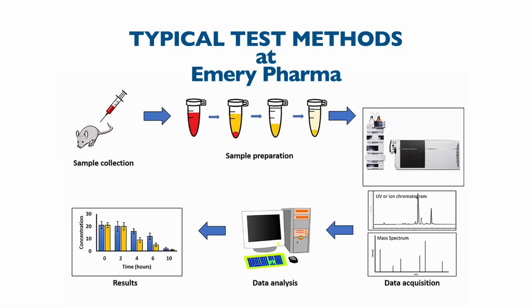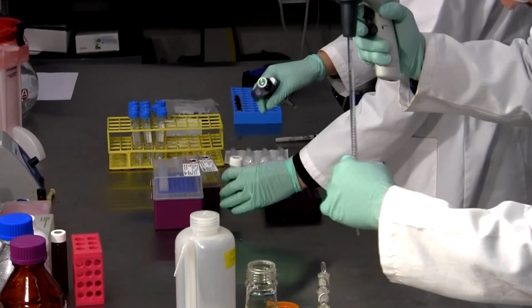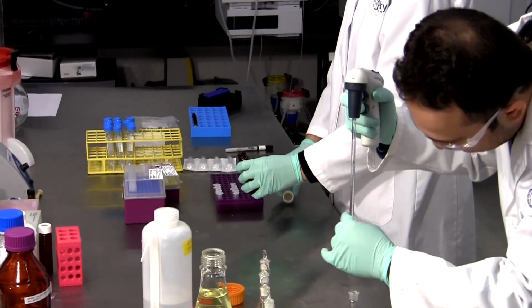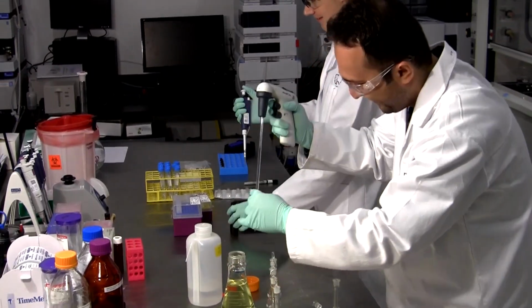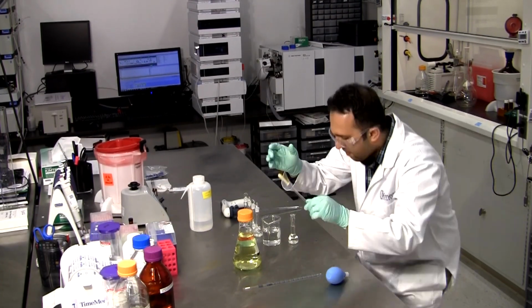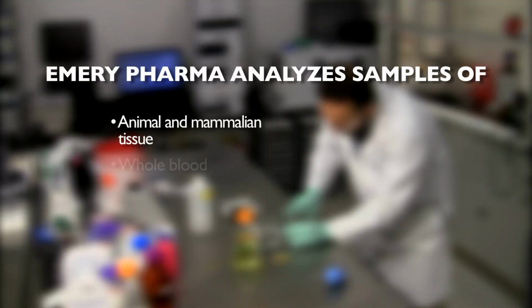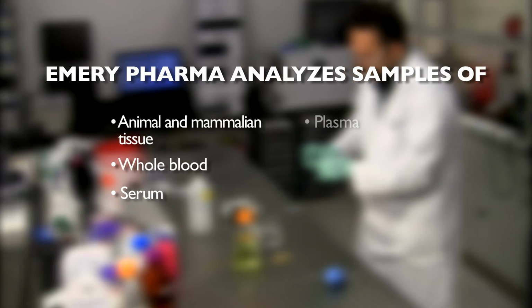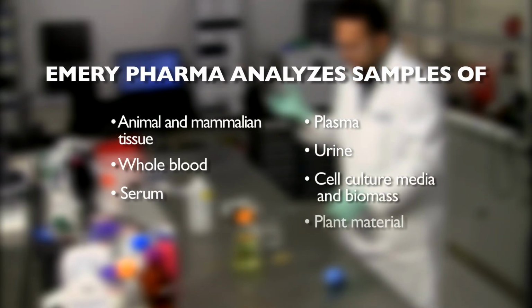The choice of sample preparation and the parameters of the analytical method will depend on the analyte or analytes of interest. Our team of analytical scientists use their years of experience to choose the most suitable approach to get high sensitivity, selectivity, and accuracy. Sample preparation is a crucial part of method development. We work with clients who need sample analysis of animal and mammalian tissue, whole blood, serum, plasma, urine, cell culture media and biomass, and even plant material.